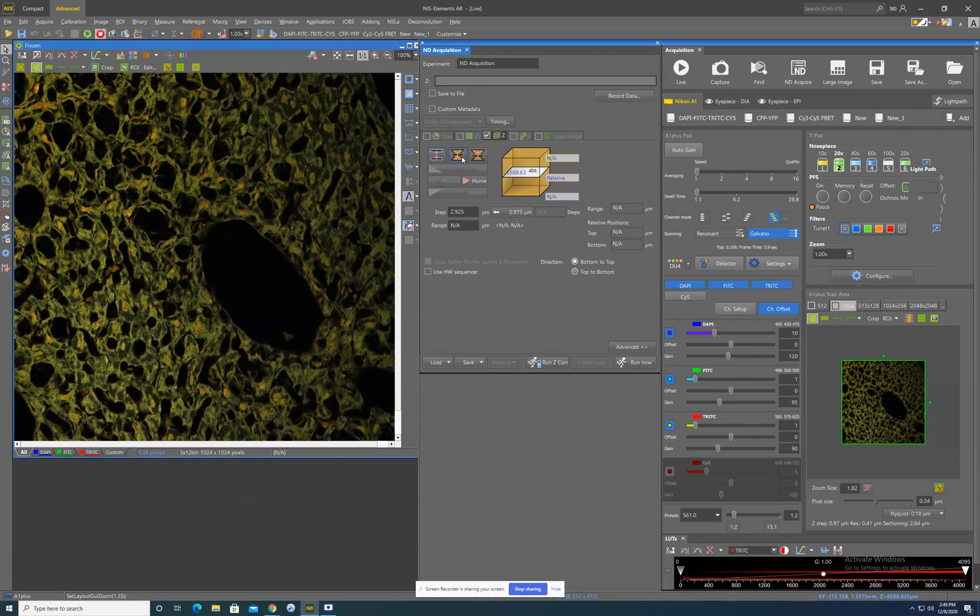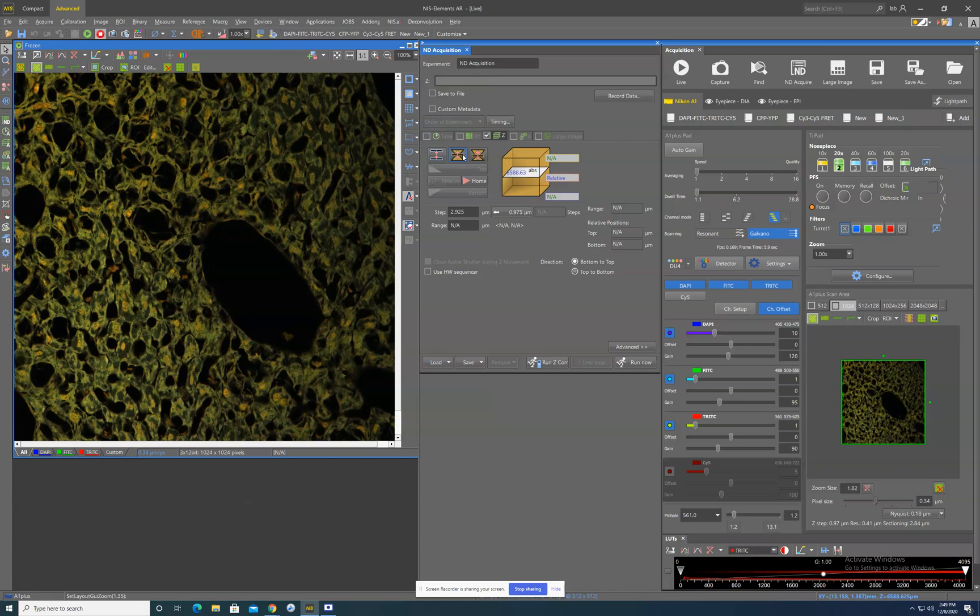Your other two options are these orange options. These are both basically that you tell it the plane that you would like it to start at. And then you can either image symmetrically or asymmetrically from that point. So like five microns above the point, five microns below the point in the case of this middle one, or like five microns above the point, two microns below the point for this other one.